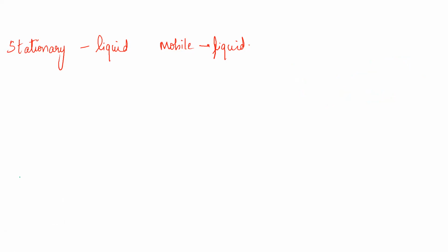Now separation of your analyte will happen due to differences in partition coefficients. We just saw what a partition coefficient is, because I told you that the analyte will have affinity in a different way towards your stationary phase and towards your mobile phase. It may have a strong affinity towards the stationary phase, so it will be retained on the stationary phase, and the mobile phase will have less of it. That affinity difference is known as the partition coefficient.